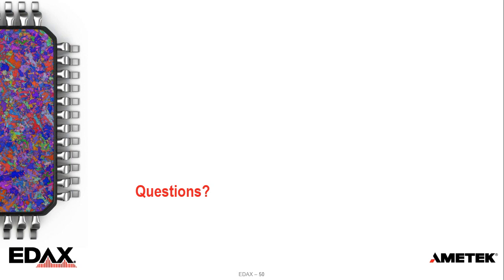Yes. So the tool that we have used is a confocal microscope. So it's not cathodoluminescence. What we did was to mark the grain that we looked at under the EBSD, in the SEM, and then we moved the sample into our confocal microscope. We found back the marker on top of this grain, and we measured pixel by pixel the photoluminescence coming out from the sample. So it's not cathodoluminescence.